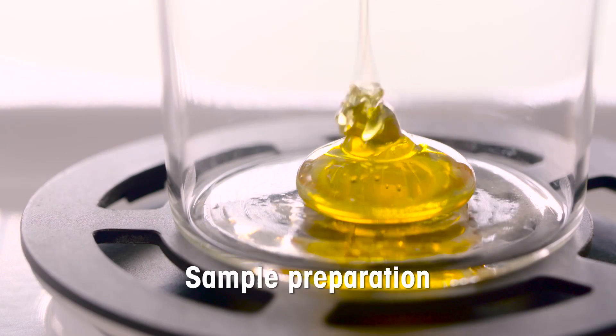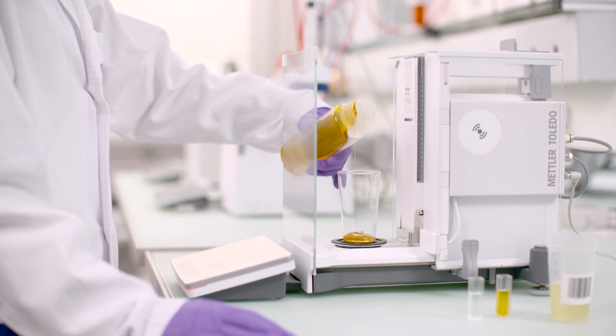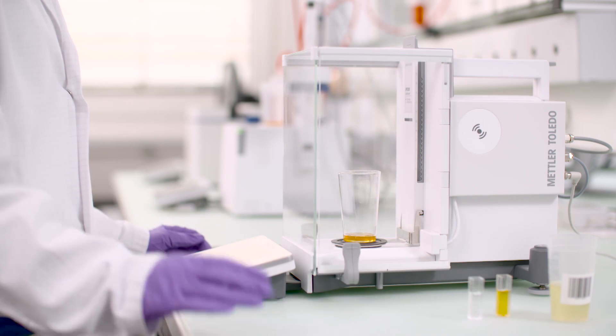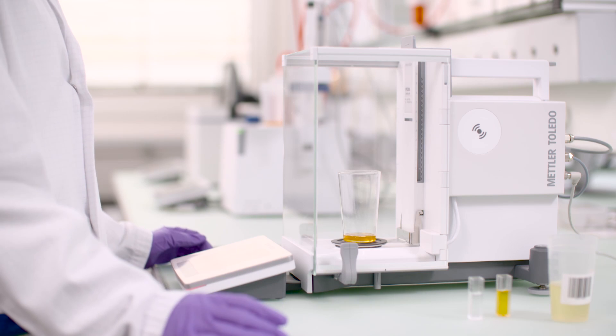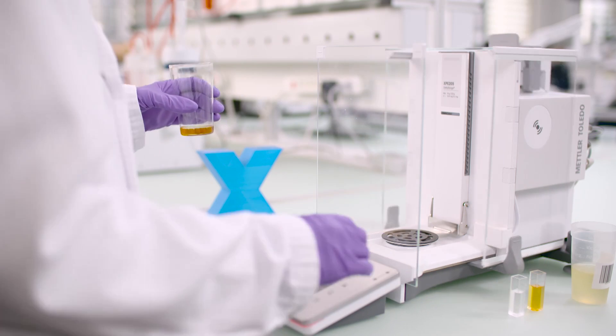The weight and sample ID is stored on the RFID tag on the sample cup. The traceability and data integrity of the RFID tag is controlled via LabX. This leads to an easy sample management which prevents a disorder of the samples.